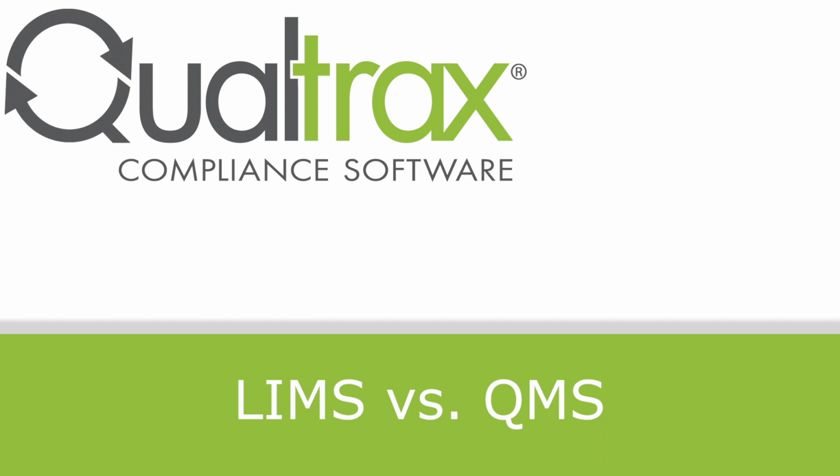A QMS should also have the capabilities for you to manage and automate both quality and business processes in your laboratory. You would also store your organizational chart, your employees' job descriptions, training checklists, and proficiency testing results to be able to prove competency of your employees and their technical aptitude to perform valid tests. In many cases, there are quality records that are not directly related to the casework, and laboratories need to have a secure, accessible way to manage this information. Laboratories are not only required to prove that their day-to-day case information is captured accurately, but that their procedures are being followed, that there is a way to prove they are being followed, and that their employees are competent to perform those tests.